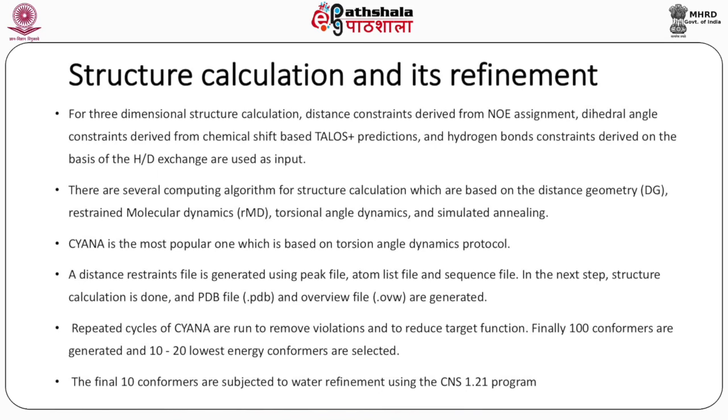There are several computing algorithms for structural calculation which are based on distance geometry, restrained molecular dynamics, torsion angle dynamics and simulated annealing. CYANA is the most popular one, which is based on torsion angle dynamics protocol.